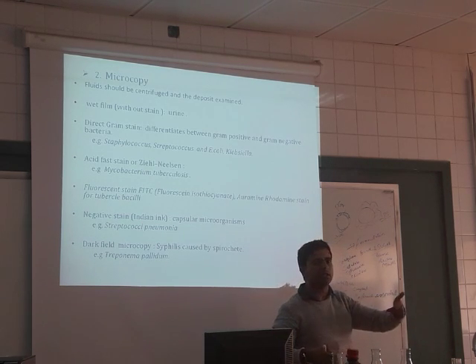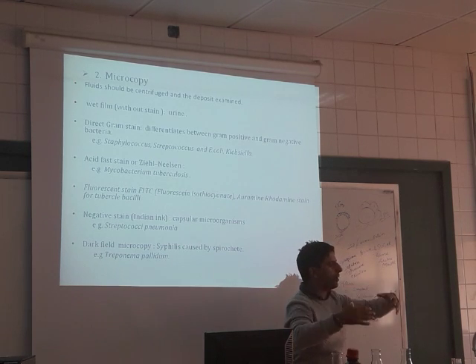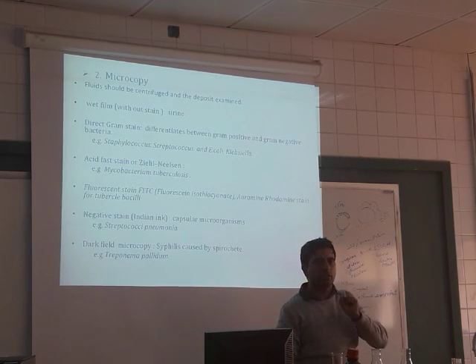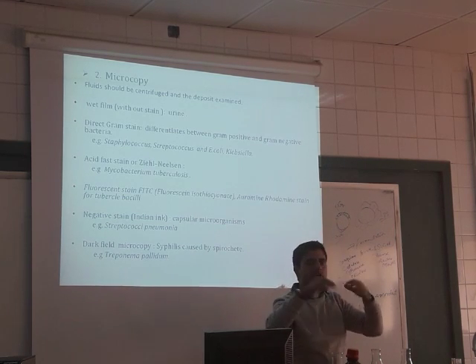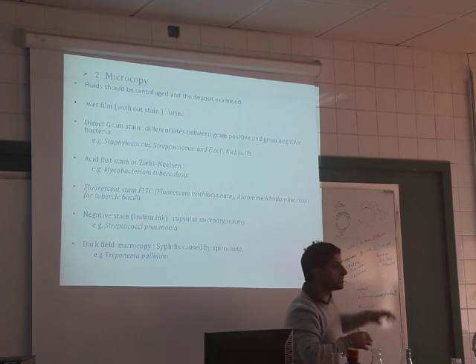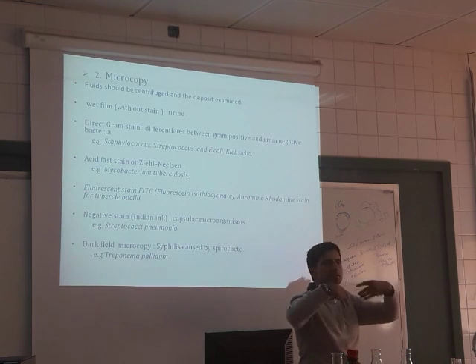When you do the washing, it removes excess crystal violet from the peptidoglycan and lipopolysaccharide layer. But the gram positive bacteria having the peptidoglycan retains some of the stain. It retains the crystal violet inside. And the lipopolysaccharide, gram negative, releases all.